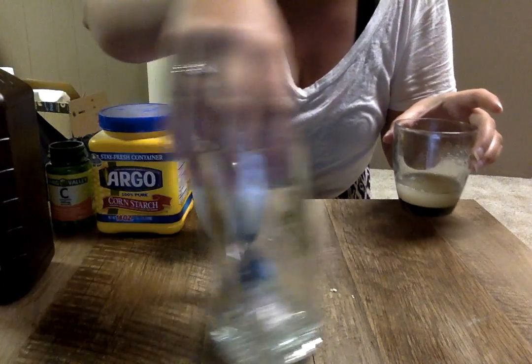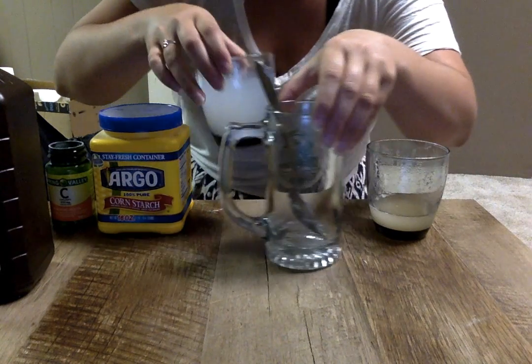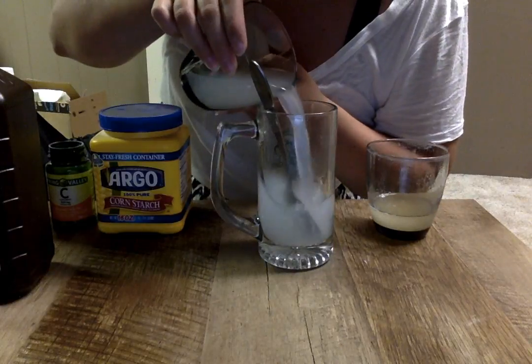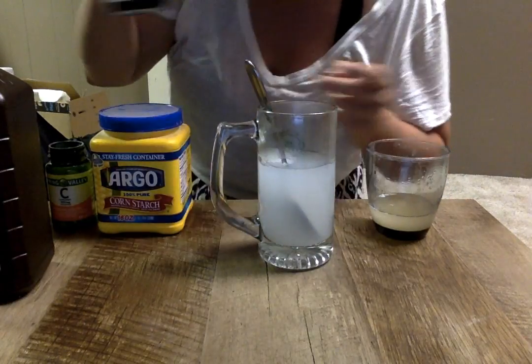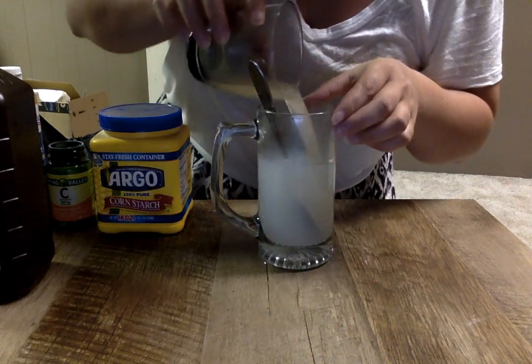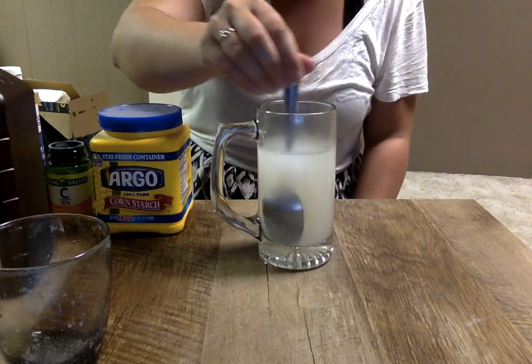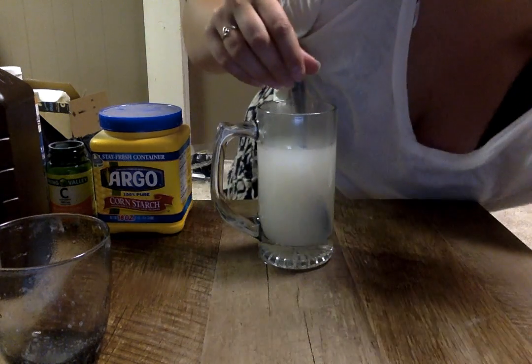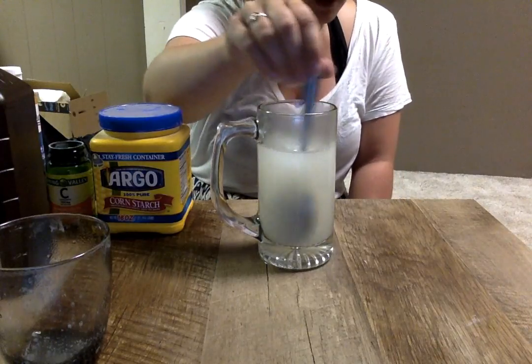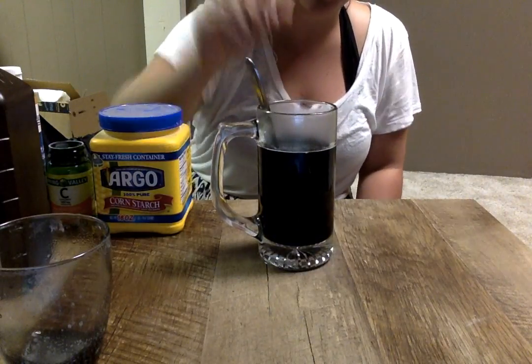now we're going to go ahead and add these two solutions together in my fancy beaker. Go. Here we go. So I warmed these up, hopefully. I know it looks a little murky. So talking about this a little bit, the vitamin C, here we go, here's a good color change that happened fast.